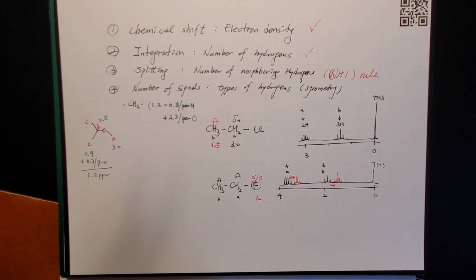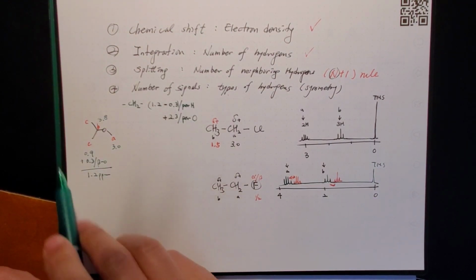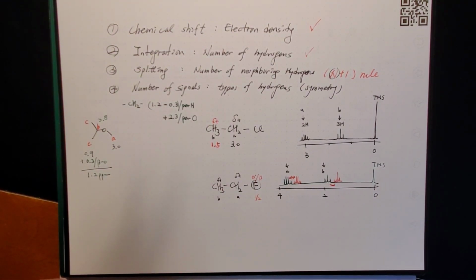That's also chemical. That's also X value. So your decision is heavily, it's not all, but heavily on X value. But on NMR, this rough estimation most of the time is good enough for you if you're non-major. So you don't have to remember these influences on the alpha carbon, alpha hydrogen, or beta hydrogen, and so on.